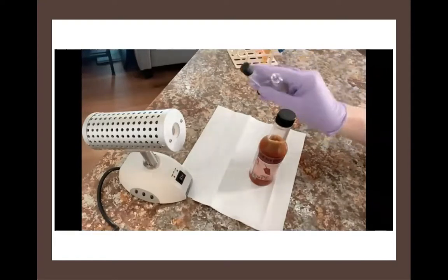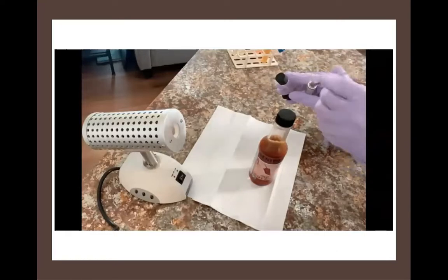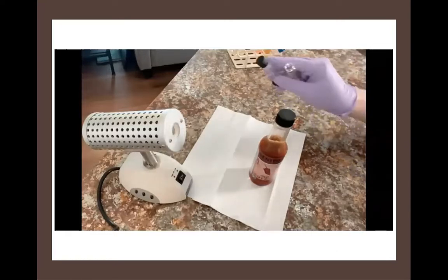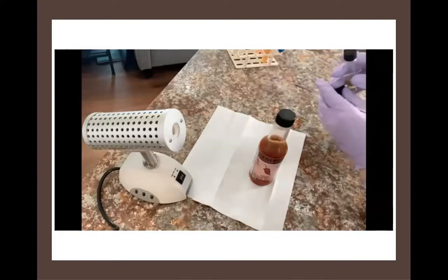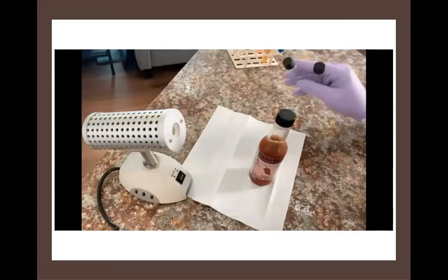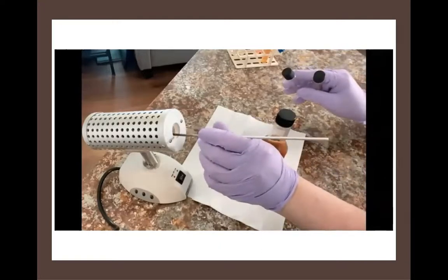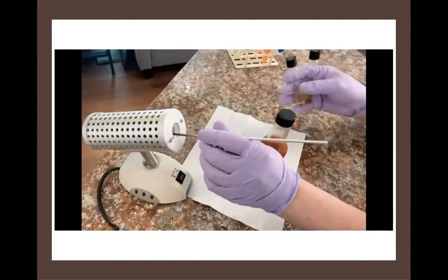Take one of your caps and put it on. Flame the clean broth tube. Place your sample into your plain broth tube. Swirl it around a little just to make sure it all gets in there. Flame it again. Close it with a cap. Remember, your loop is dirty right here, so don't forget to put it back into the incinerator to sterilize it once again.